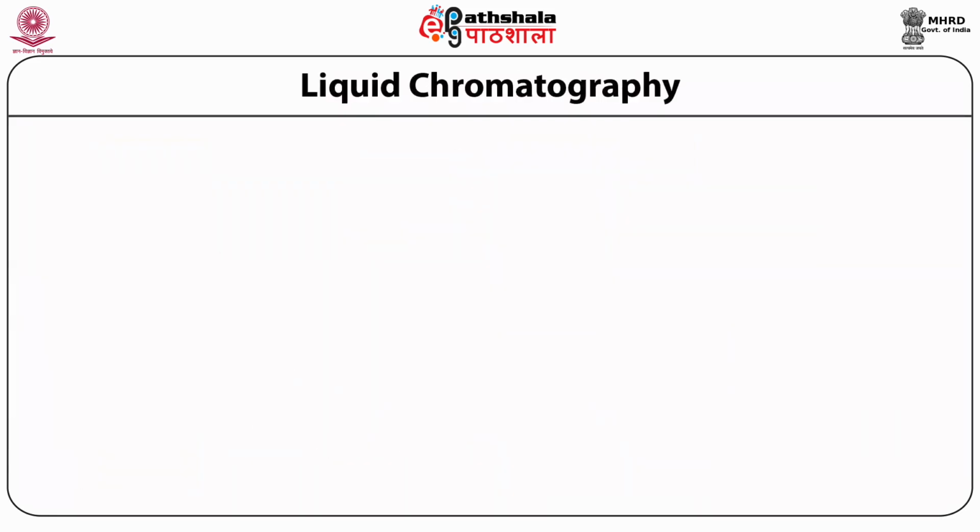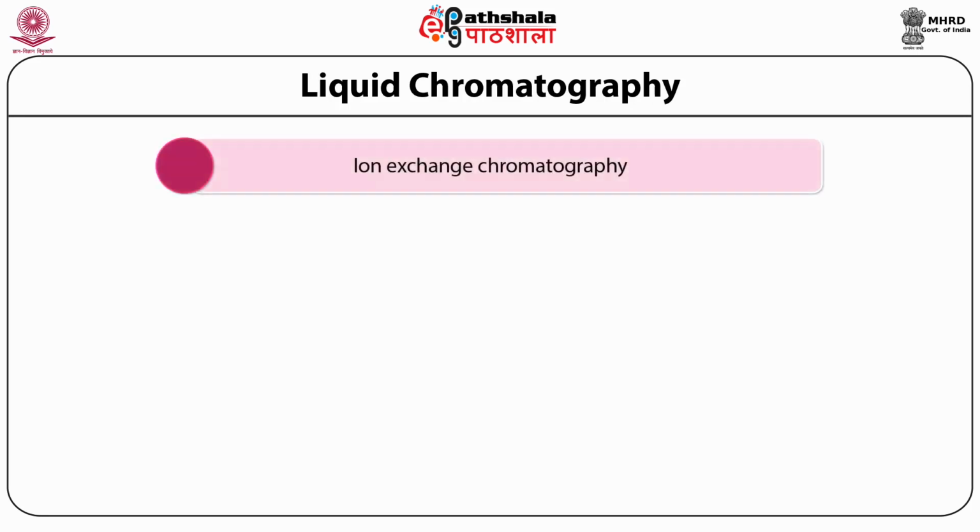There are several liquid chromatography methods. You can use ion exchange chromatography. If you have a protein which has a specific charge, or you can change the pH to give the protein a specific charge, you can use anion or cation exchange and make the protein bind, and elute either by changing the pH or with a salt gradient. Increase the salt so that your protein gets eluted.